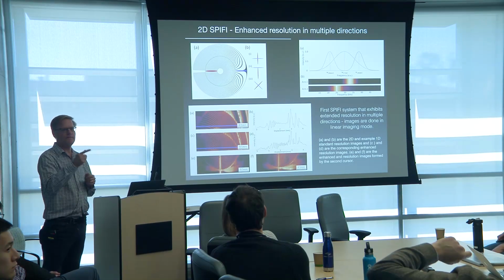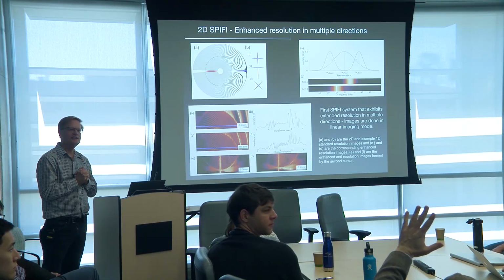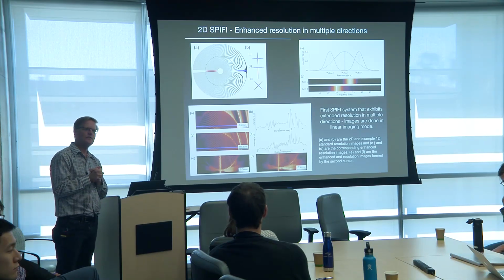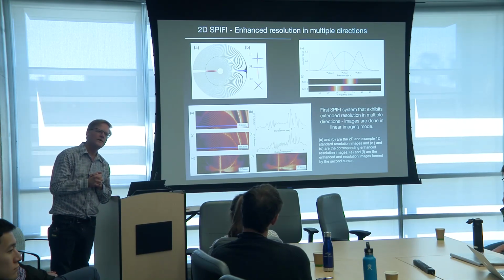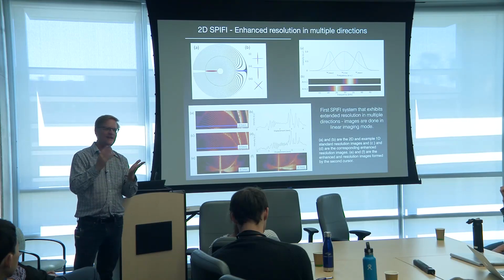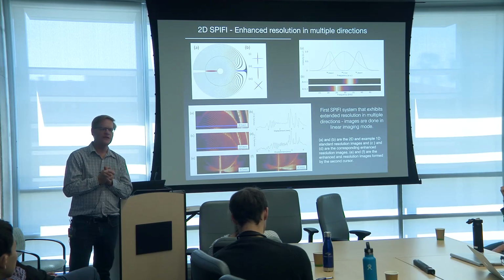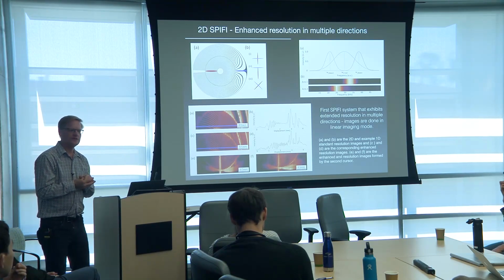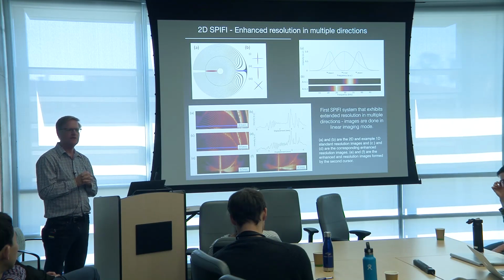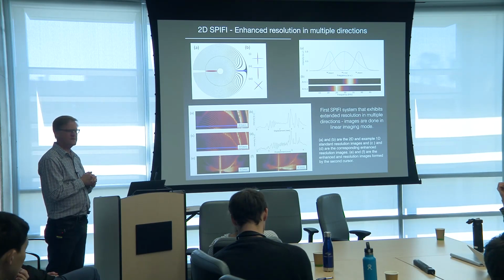Question about the chip system. So basically you say it's like having a light sheet that scans basically. Yeah, that's the way they've got it set up. Did they try it on fluorescence imaging? Is there anything out there? So they did that image I showed of the lens. It's not intricate, but that was done with two photon fluorescence imaging. Well, did they try it on a scattering mouse? Not yet. That's where I say it's really just getting started. They've got it all worked out, but this is really kind of a preview. Jeff's got all the theory worked out. So yeah, it's intriguing, I think.